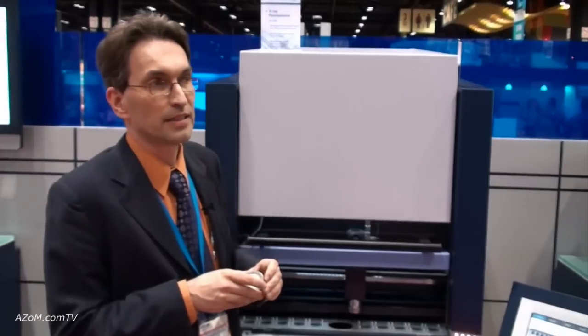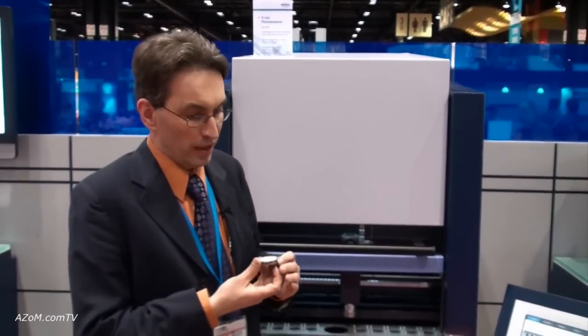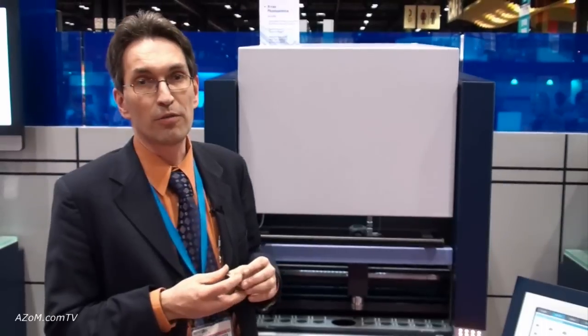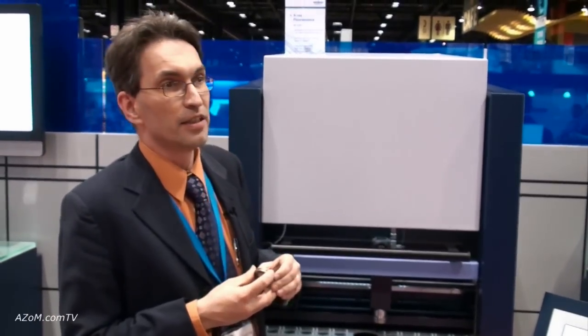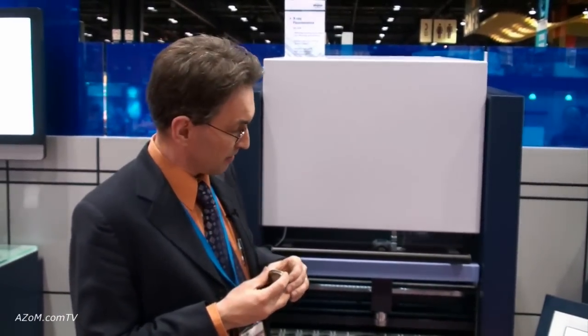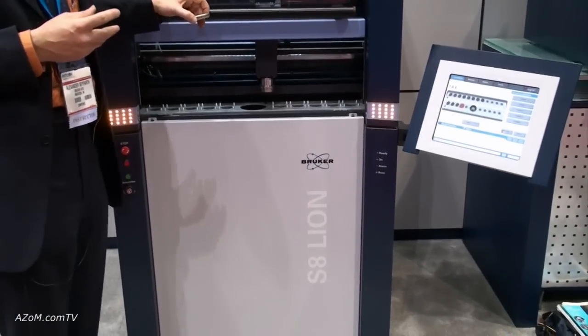For high throughput plants which control more than one kiln, you need to have the result much faster. In this case, you take the same sample and run it with what is called a multi-channel unit. At PitCon, Bruker introduced, after a long time of not having a multi-channel unit, the newest member of the S8 series: the S8 Lion, which is a brand new multi-channel unit.